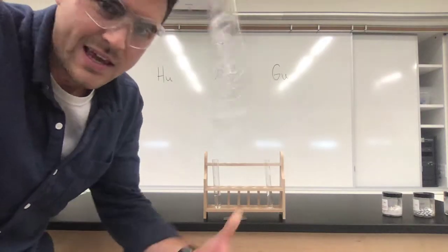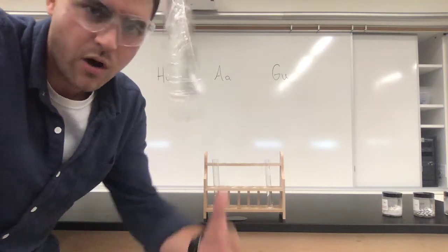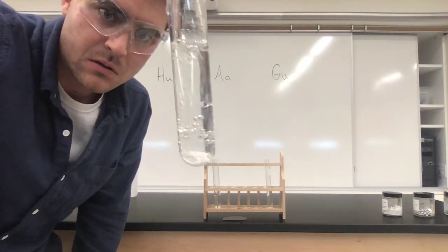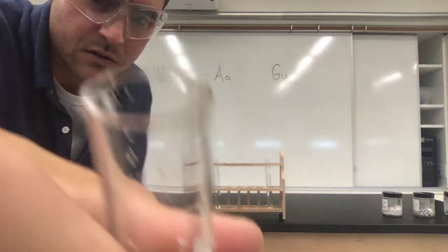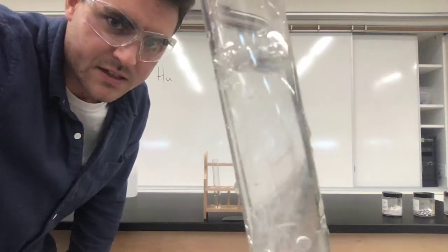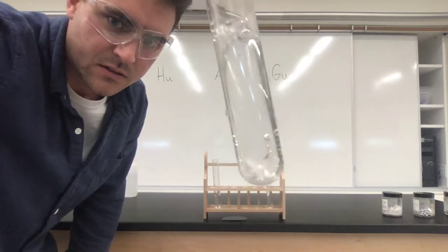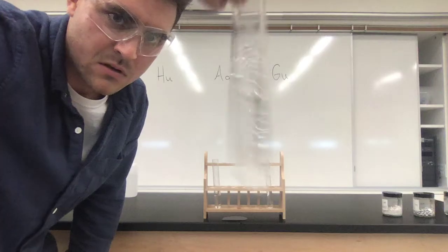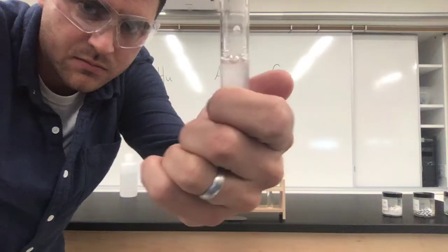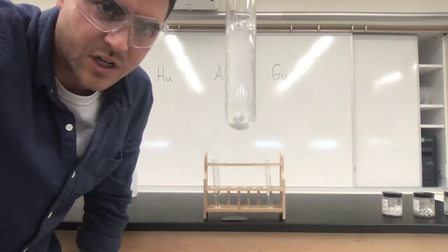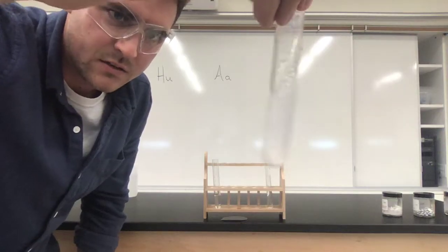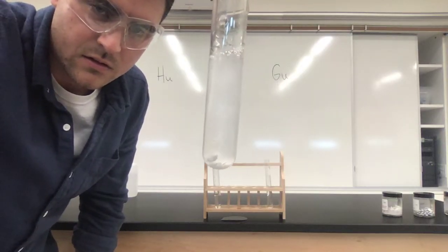Can you see it? See all those bubbles starting to form? Look right at the Walonium sample right there. Look at the bubbles coming right off of it. More and more bubbles starting to form. Let's give it a good mix. Oh, now we're getting more bubbles to form. Take your observational data. What are you seeing? You can see the bubbles starting to form. Have you ever seen anything like this when it hits the water or when water mixes with something around your house? Can you hear it? I don't know where the speaker is on my computer, but I can hear it. It's pretty loud. And it's getting more and more intense.